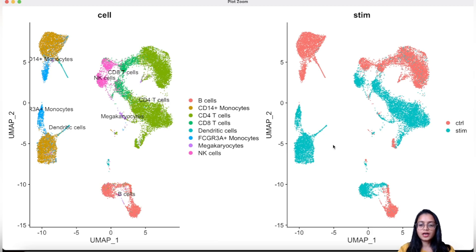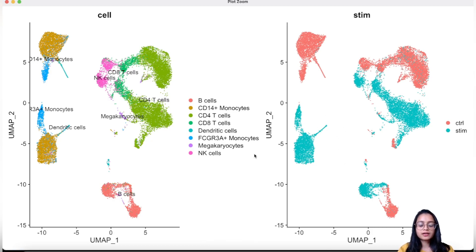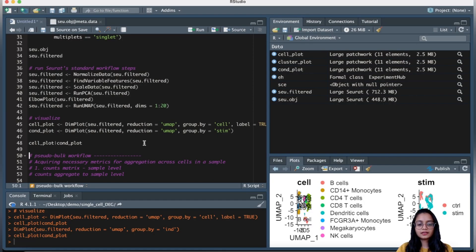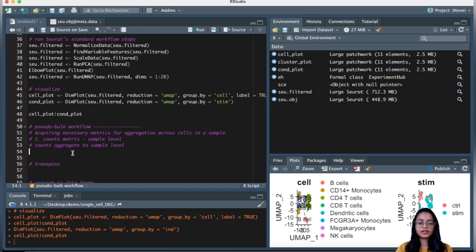For this analysis, it really does not matter whether the data is integrated or not, because the raw counts from the count slot will be used — not the normalized data from the data slot. What I want to do is compare B cells between two conditions — stimulated and control — by aggregating counts to the sample level and identifying genes with different expression patterns in the stimulated group versus the control group. To do that, we need to aggregate the counts to the sample level.